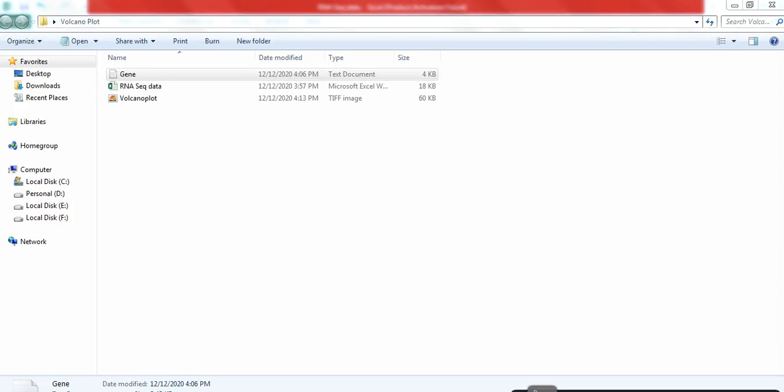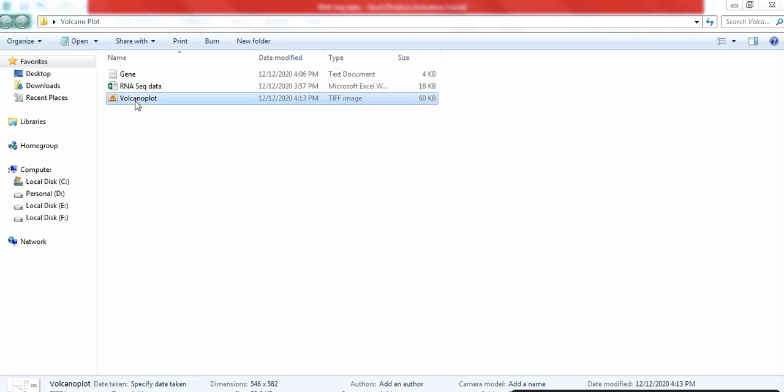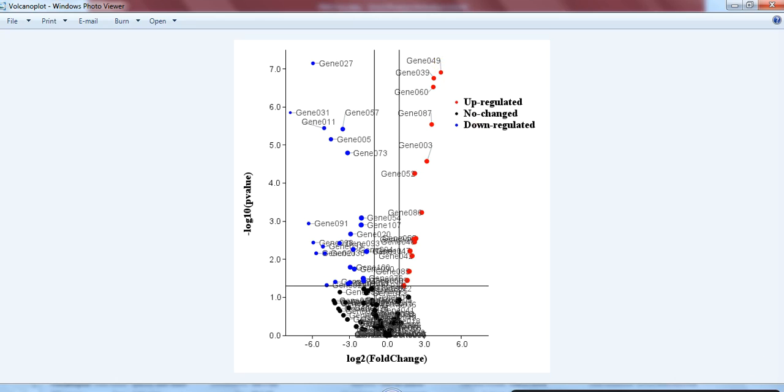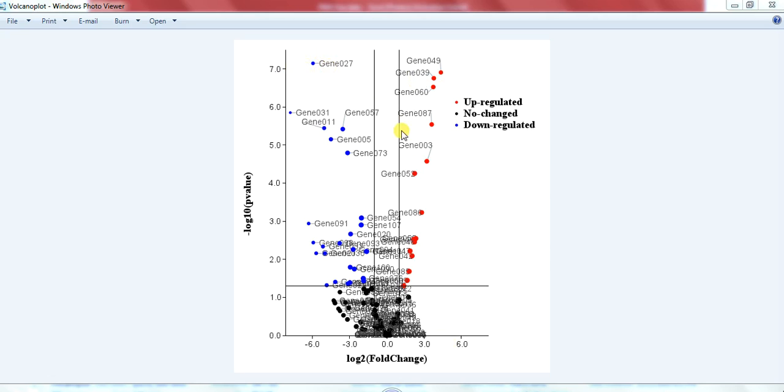Or you can also edit it by using other tools like Photoshop or any other and then open that folder, open that figure and use it into your manuscript. In this way you can see in a single view that gene 49 is upregulated and significantly upregulated, and this portion of the blue one shows the downregulated and this one shows the upregulated.